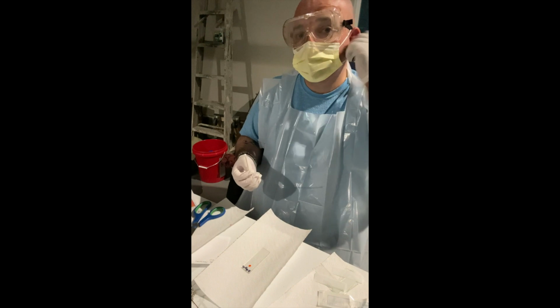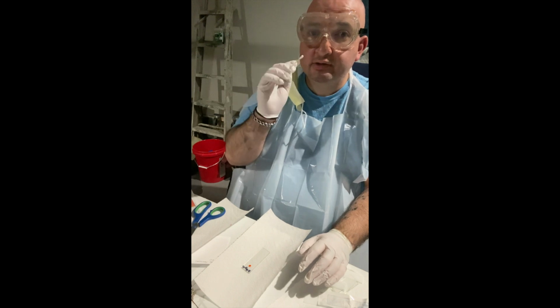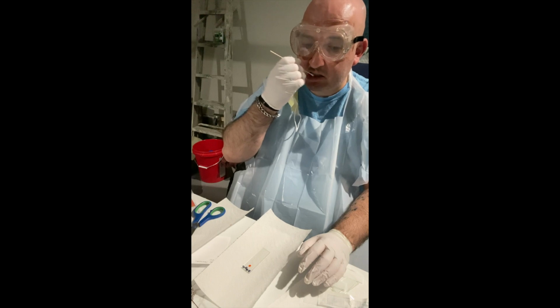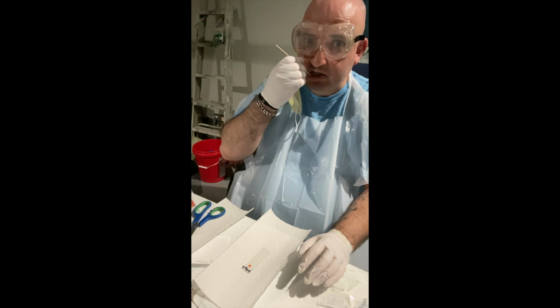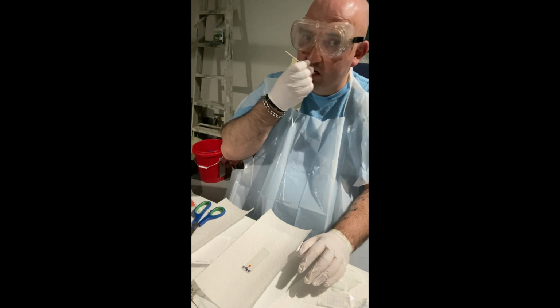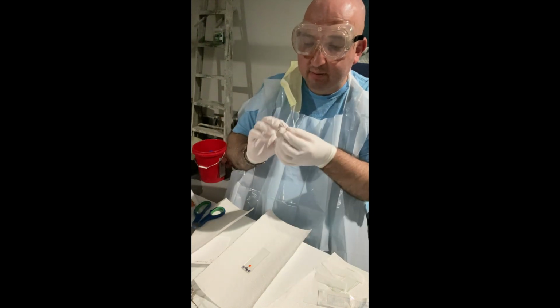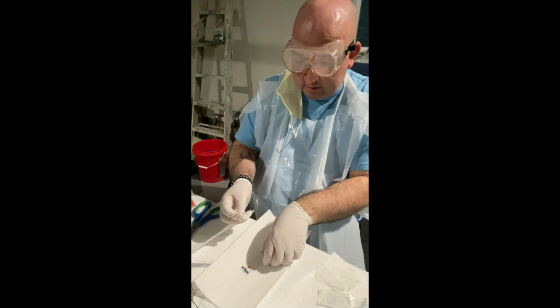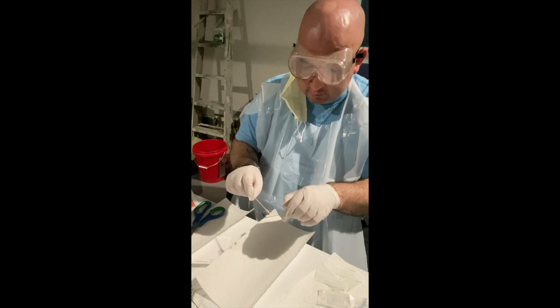So I need to remove my face mask for this. And again, this is going to go against my teeth and gums. Okay, so I have my plaque specimen here. So now I'm going to rub or agitate this in the Congo red to spread the specimen.